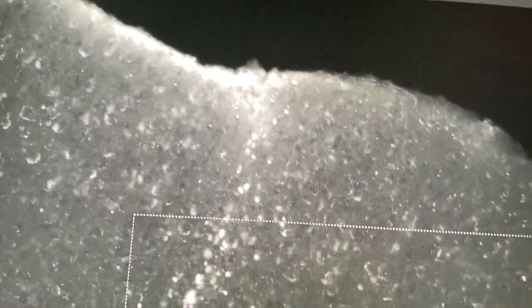Here is probably where I put the syringe in. And then if you go down, I don't know why it's at that angle. But there should be somewhere down here a big old pocket of transfected cells. And there just aren't. There just aren't any. And I don't know why.